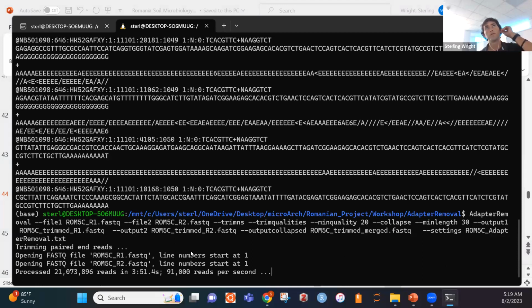And so I actually had this discussion with Poria about this yesterday, and I'd be curious to know if anyone knows this answer. With sequencing technologies, not only are costs decreasing and more people going to be doing high throughput sequencing, like shotgun sequencing, in the future, another challenge of running these sorts of analyses is that these sequencing technologies are also giving us greater output.